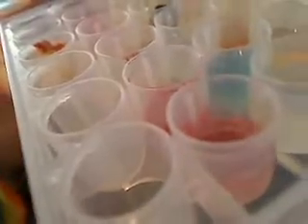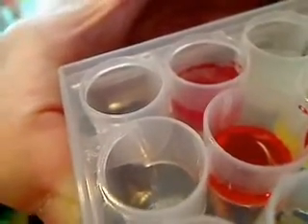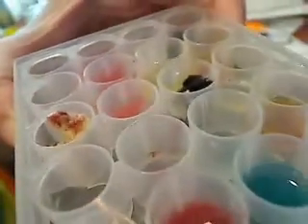Now the Sudan, same kind of thing. Red and water, that's just red. That's not a reaction. But when you go down here to the fat, it looks like a real orangey color. This is going to be way better when you've got it right in front of you, but I'm just giving you hints as to where to look for color change.